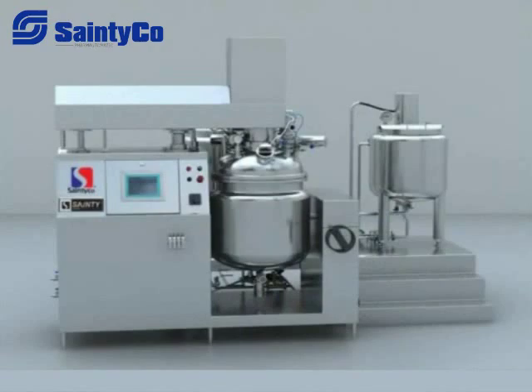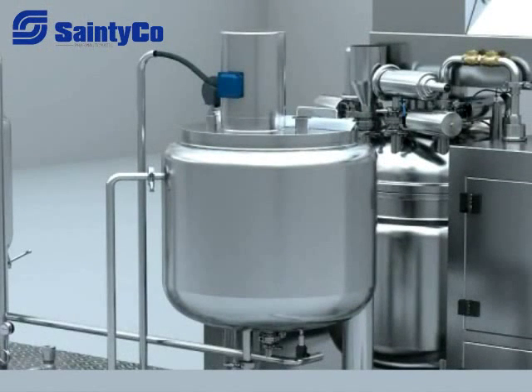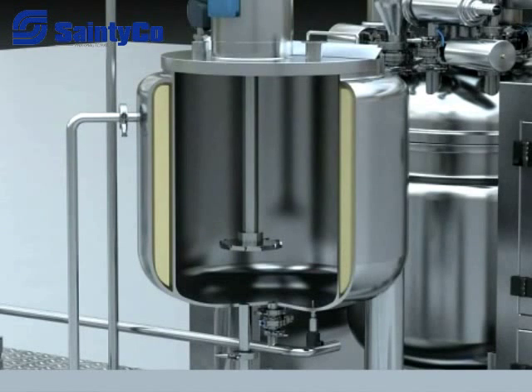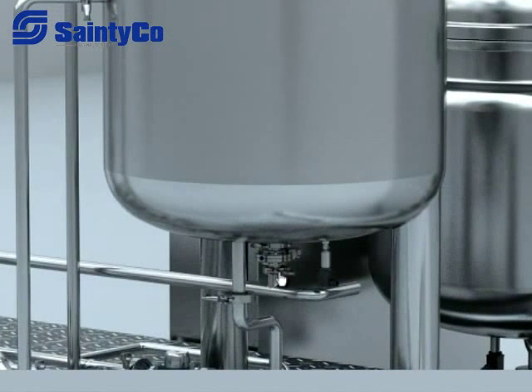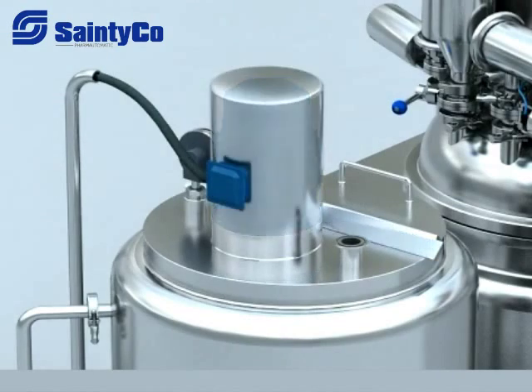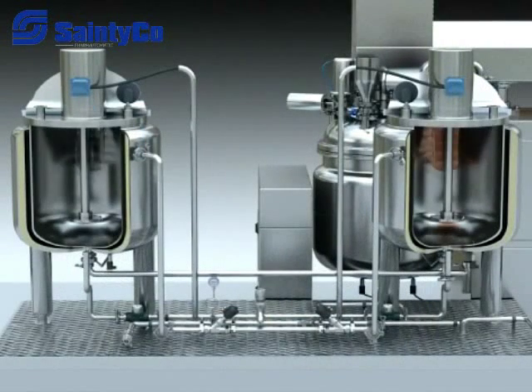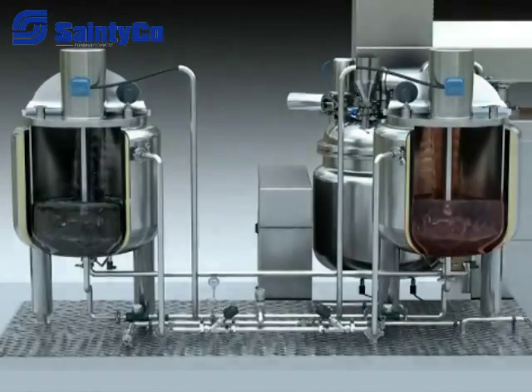5. Blending system. It is made up of a working platform, oil tank, and water tank. The structure of the oil tank and water tank is made of three layers: upper half open lid and bottom ceiling head. The bottom ceiling head is connected with the flange-type tank, and the thermal protective layer adopts PU foam technique. Other components are a wave wheel mixing device in the tank, discharge valve, and temperature sensor at the bottom of the tank, plus a half open lid, mixing motor, and inlet and round thermometer at the top of the tank. After opening the half open lid, material must be loaded into the oil and water tank, and then mixing starts.